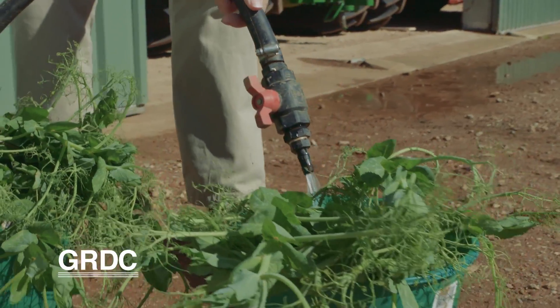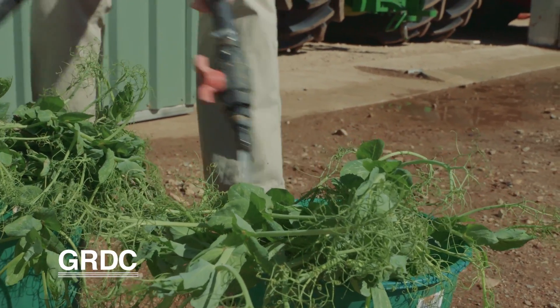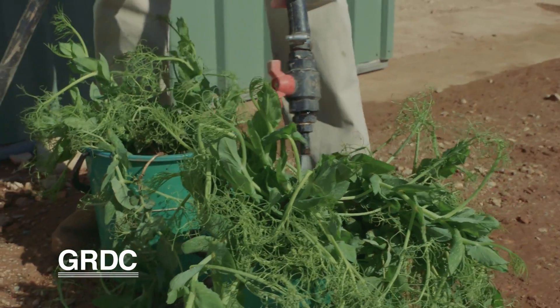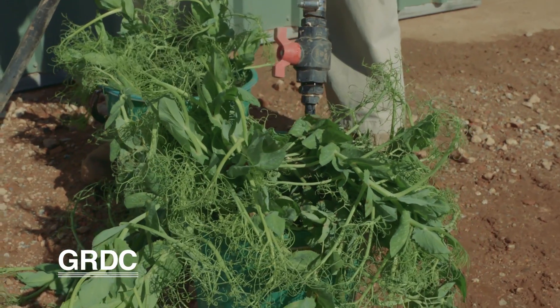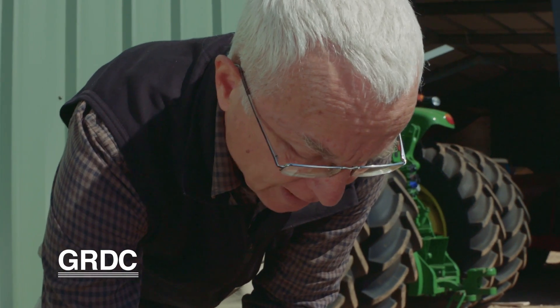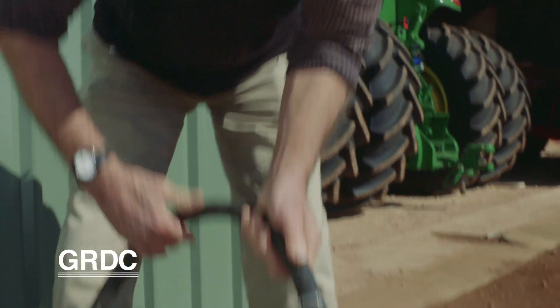We'll let these soak for a few minutes. The heavier your soil, the longer you might want to let these plants soak — you can even leave them for half an hour if you've got a really heavy soil. We need to wash fairly carefully because the nodules can come off the roots and the root systems can break.